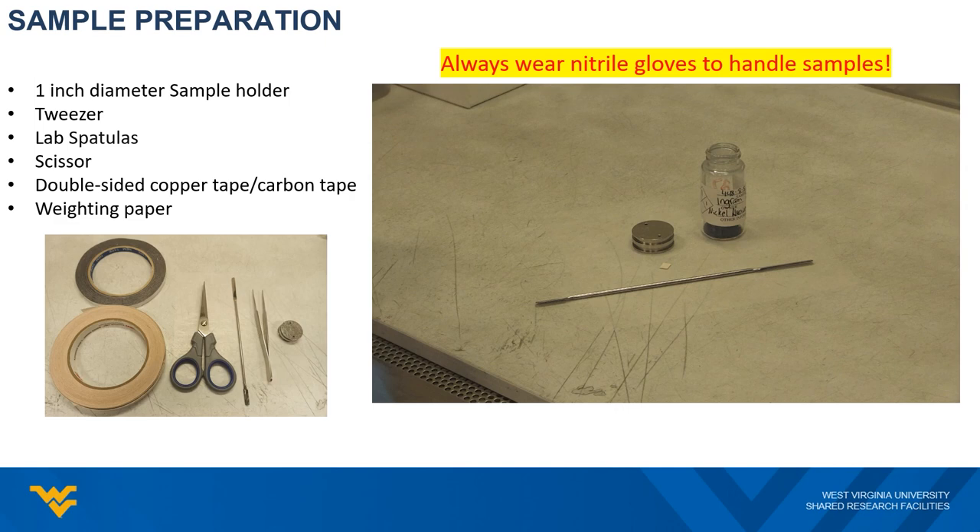Since the sample will be transferred into an ultra-high vacuum system, you will need to wear nitrile gloves at all times during sample handling. Otherwise, your fingerprint or body grease will stick to the sample and outgas continuously. That will cause a vacuum issue.